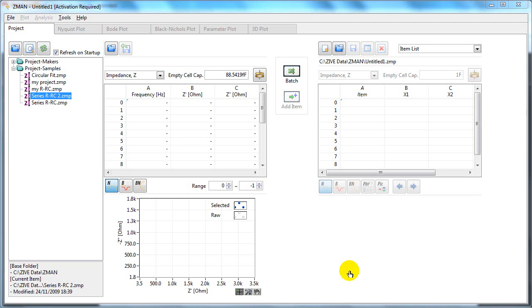This screencast covers the modelling function in the Z-Man software. This is to fit your EIS data to an equivalent circuit.